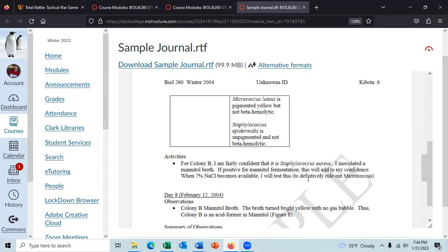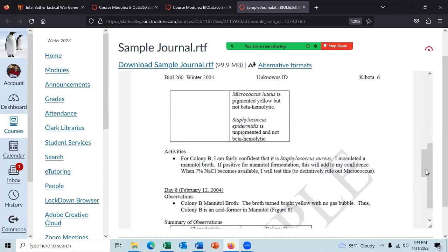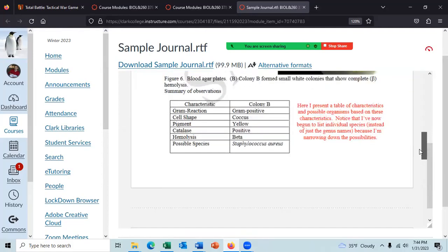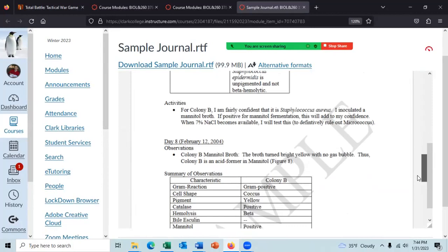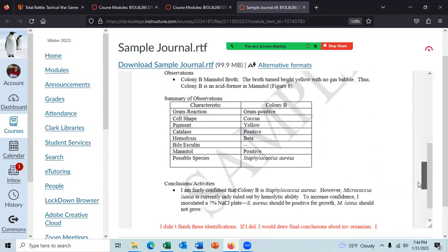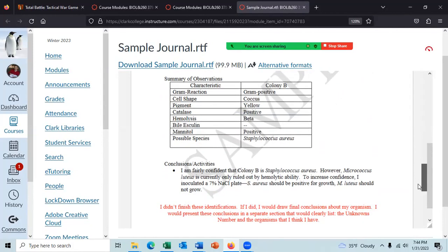Dang, 7% sodium chloride becomes available. Oh, he wasn't able to run that test because there were no 7% sodium chloride plates. That's why there's no observation for that test. And it looks like he may have identified it, so he may have never run that 7% sodium chloride test.